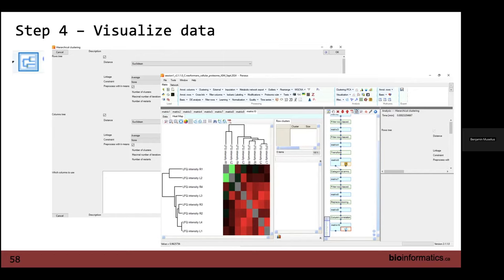And is there any way to have our data and, for example, use the other package that we use, like clusters, to make our data? Because, for example, in our lab my supervisor has clusters. That's why I want to know if I can just have my matrix, transfer it, and use the other packages.